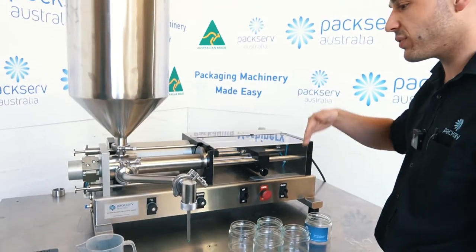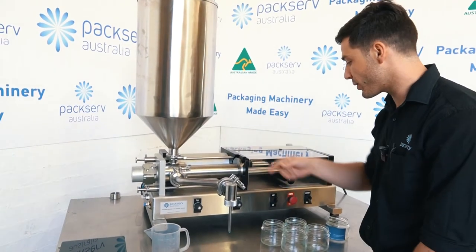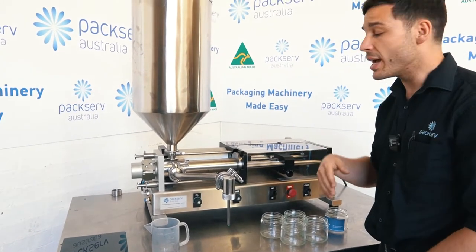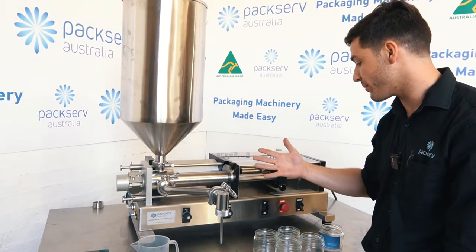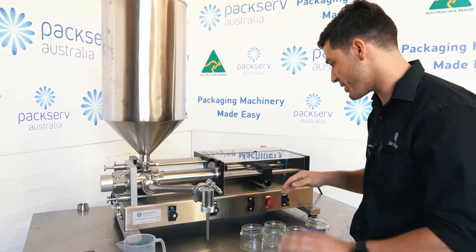Next step, you want to flush the machine. Generally if you have a beaker or a bucket, just cycle through — set this to on and run and let the machine constantly cycle — just to eliminate any air inside the system, because this will cause you to have variances in the fill volume from fill to fill. I've already done that process so we don't need to worry about it in this situation.